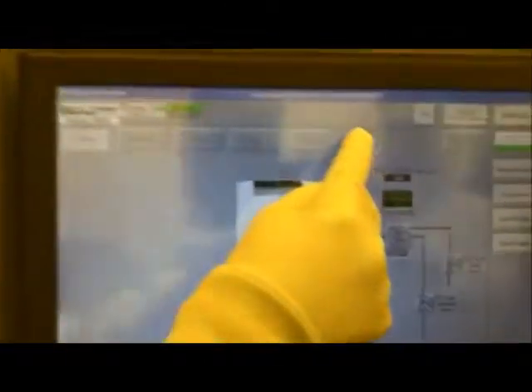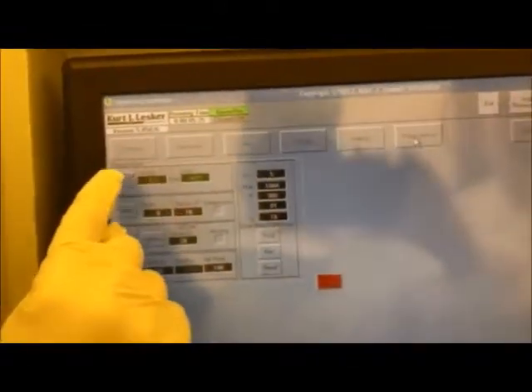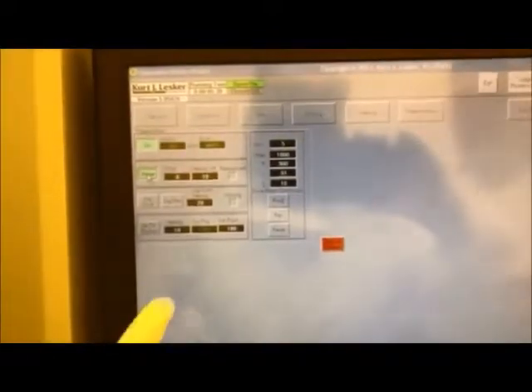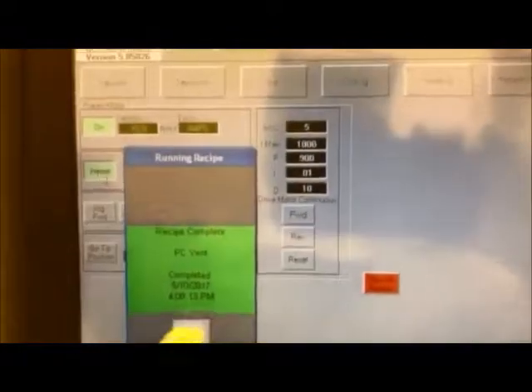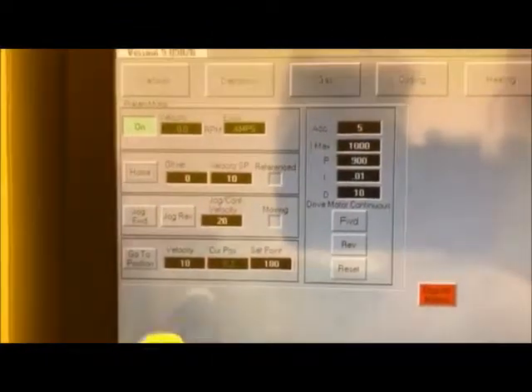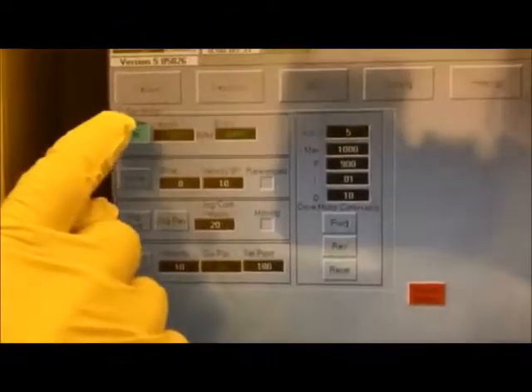After you open the chamber, you are going to unload the sample holder. I'm going to first home the position. I turn it on, home, and you should see the position go to home, and then I will turn this off, and then I can take this sample plate out.